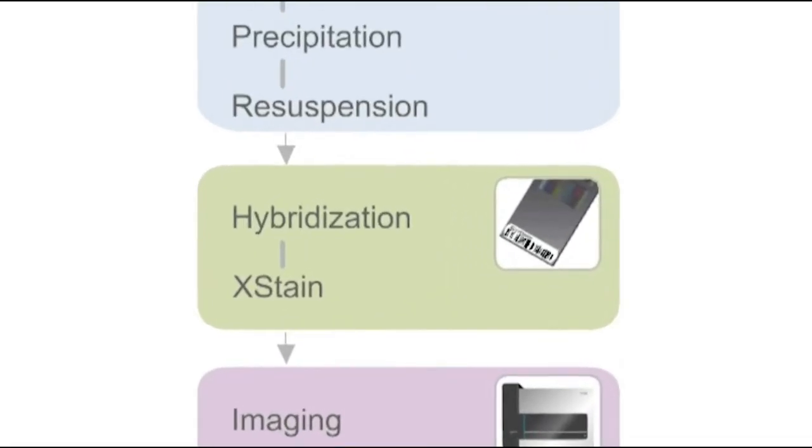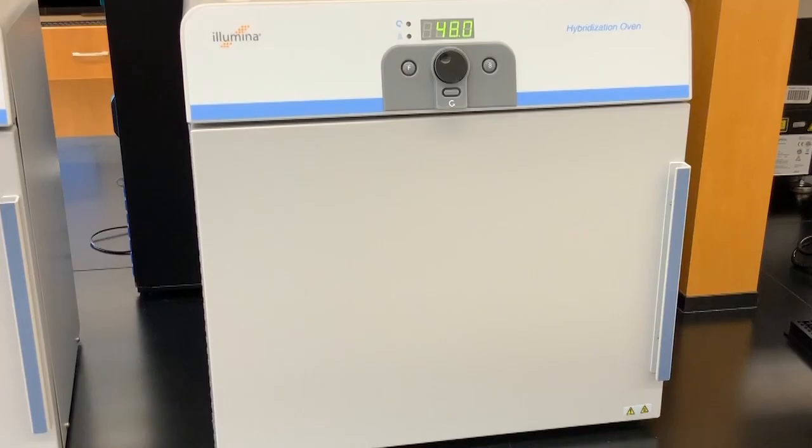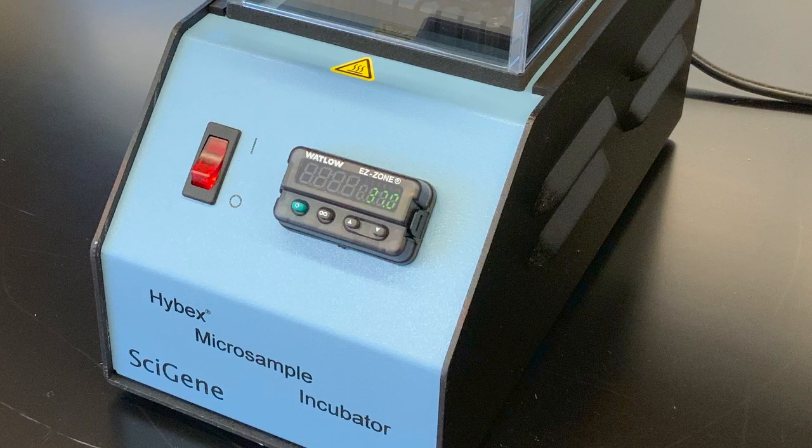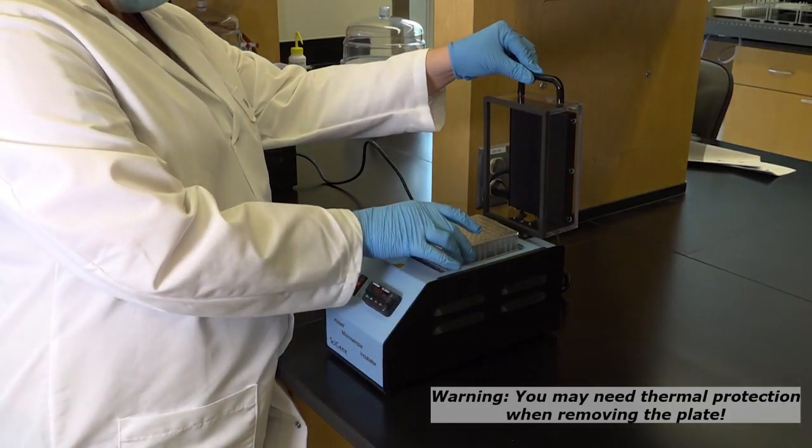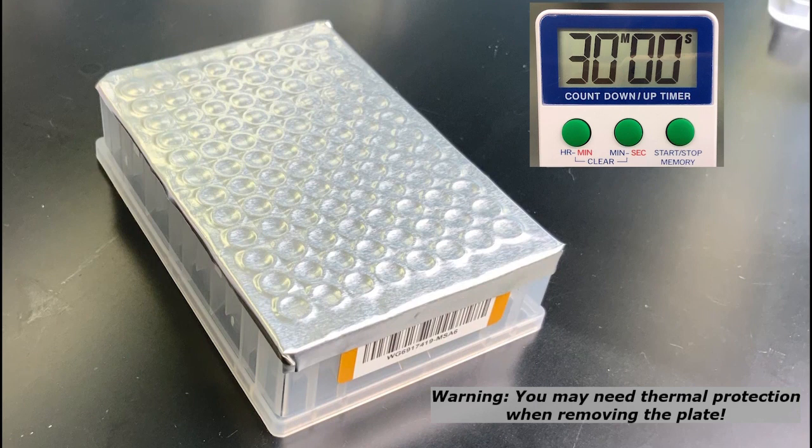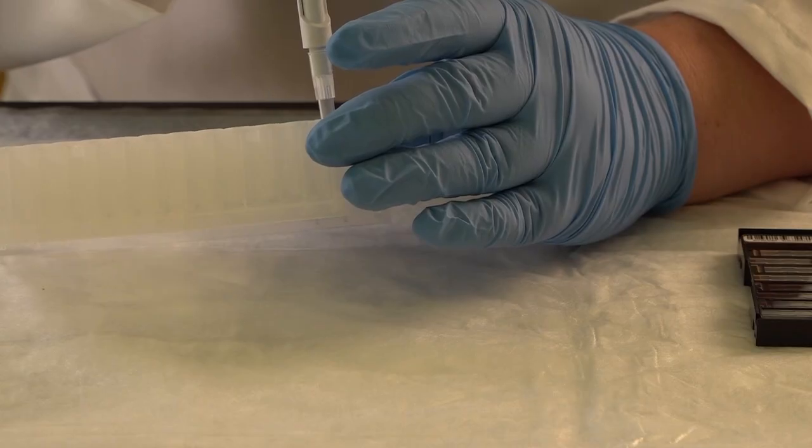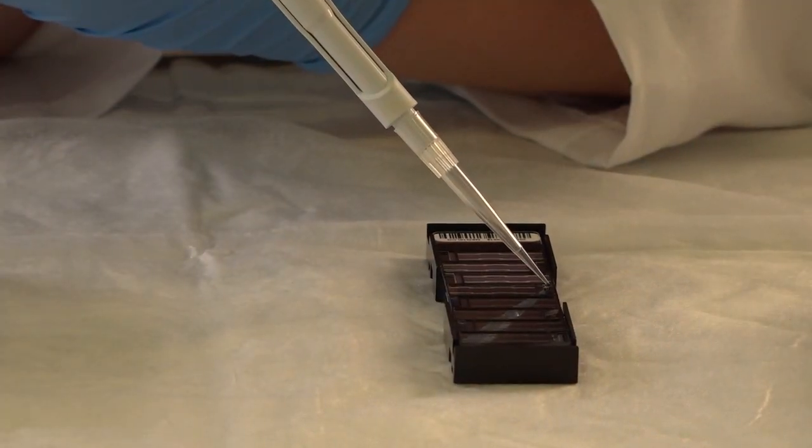The next step in the Infinium assay is hybridization. If not already set from the resuspend step, set the hybridization oven to 48 degrees Celsius and preheat the heat block to 95 degrees Celsius. Following the incubation at 95 degrees Celsius, allow the amplification plate to sit at room temperature for 30 minutes. Pulse spin the plate prior to proceeding with hybridization. In the hybridization step, the sample is removed from the microtiter plate and applied to the bead chip.